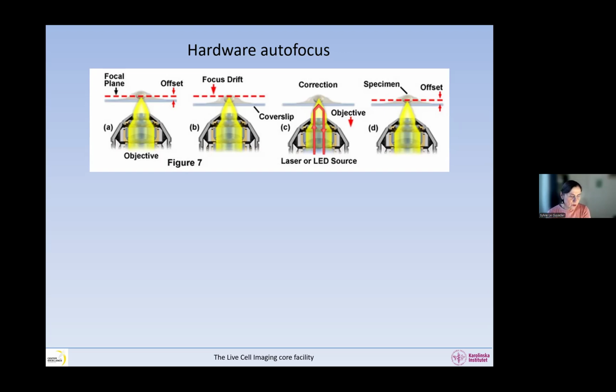You can use, like Gabi says, a machine that refills the water. That exists; it's called a water dispenser. But you can also use, in some cases, certain objectives that are designed so that you can put a special oil that has the refractive index of water.